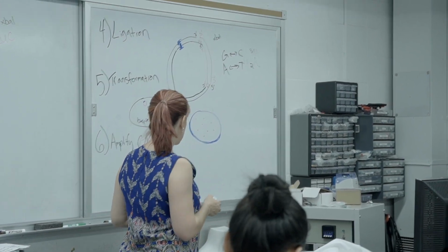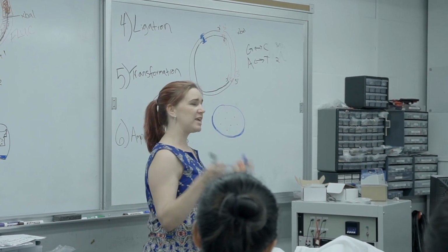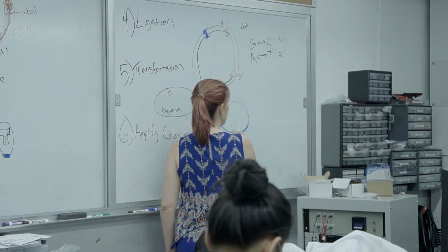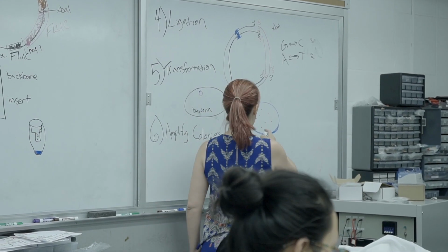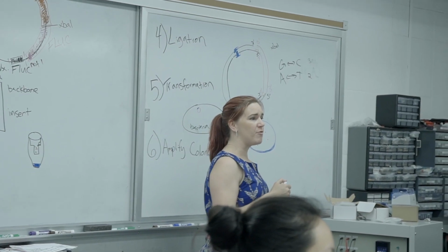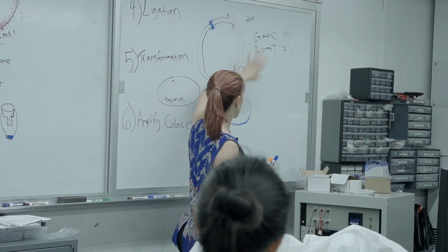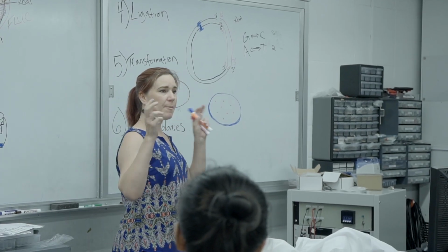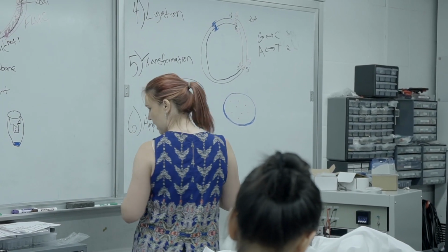So I'm going to use basically statistics, and there'll be a certain percentage of chances, depending on how many of these colonies I have, that at least one of them will be right. And I only need one of them to be right. So I will pick off 2 or 3 colonies, or maybe if I think there's a high chance that this didn't work, I might pick 14 colonies, and I'm going to grow them all up, and then I'll have a bunch of tubes of stinky bacteria in the morning.